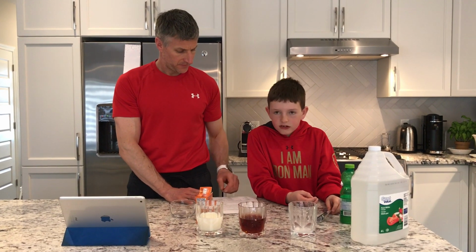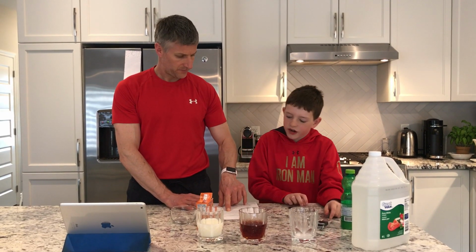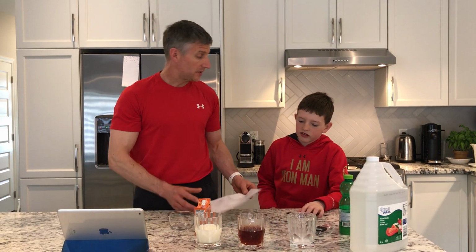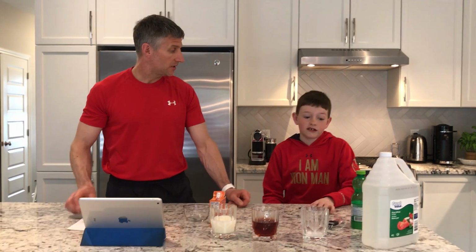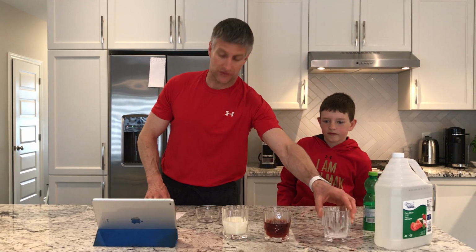We had bubbles are visible that are not created by heating. And is that evidence of a chemical change? Yes, that is evidence of a chemical change. Perfect. Success on the first one.